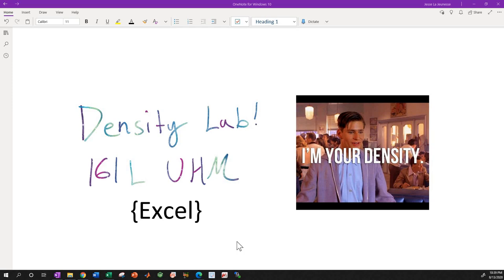This is going to be the video for your density lab, the Excel portion. If you go to your lab manual, you'll notice we go through in great detail how you're going to use Excel or some similar software to process and analyze your data from your density lab.